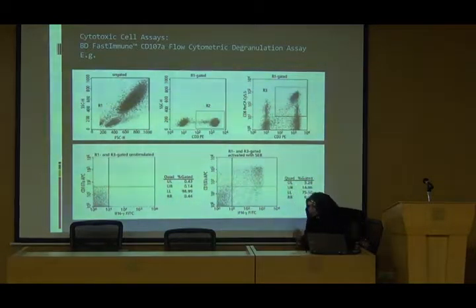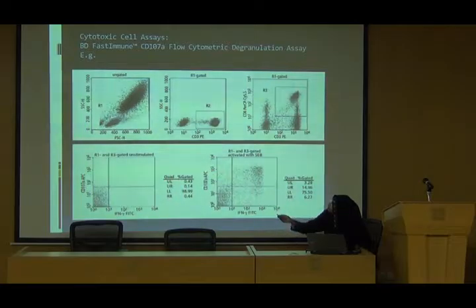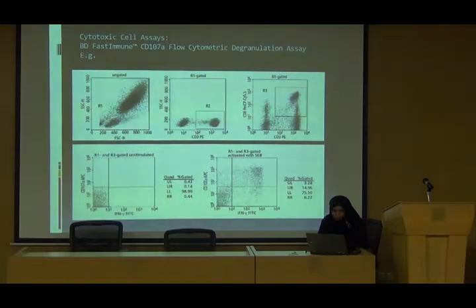Okay. On the computer you can... Around here could be mainly basophil. This is the lymphocyte gated, and here it will be the monocyte, and this big... Can you see? No. Oh, you can see. So, this one is what? Yes, yes, yes. No, no, yes. We have to go to the smaller projector view, yes. In the PowerPoint, yes. Then the cursor will go.